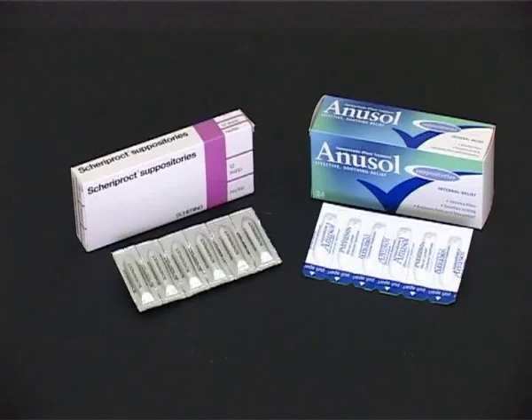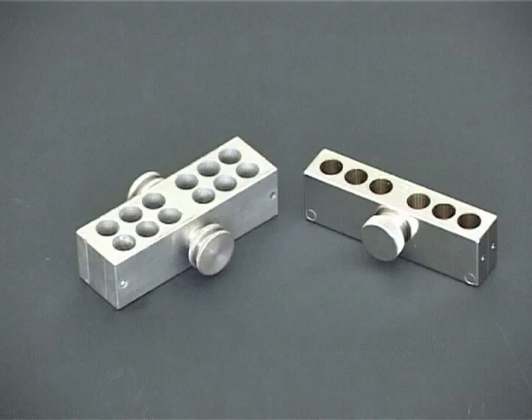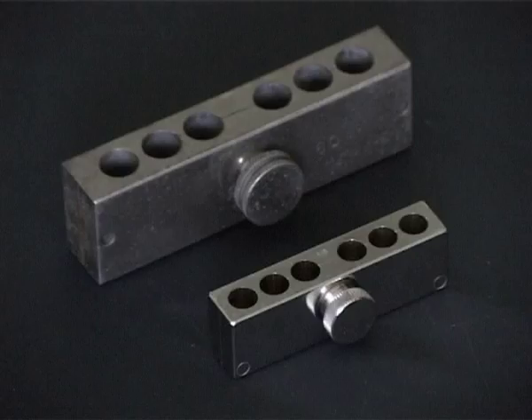Here are examples of proprietary suppositories and their packaging. These are two traditional suppository moulds used in extemporaneous dispensing. Larger moulds, as shown here next to a typical 1g suppository mould, can be used to make pessaries.